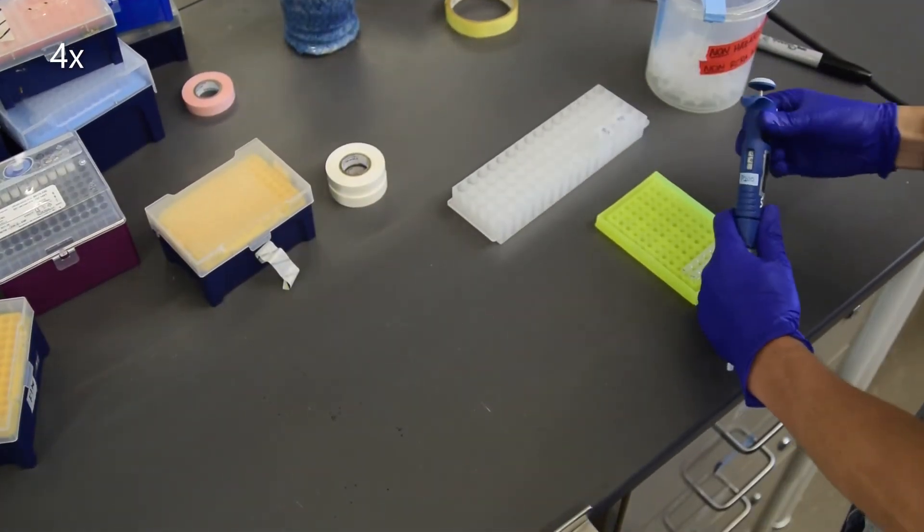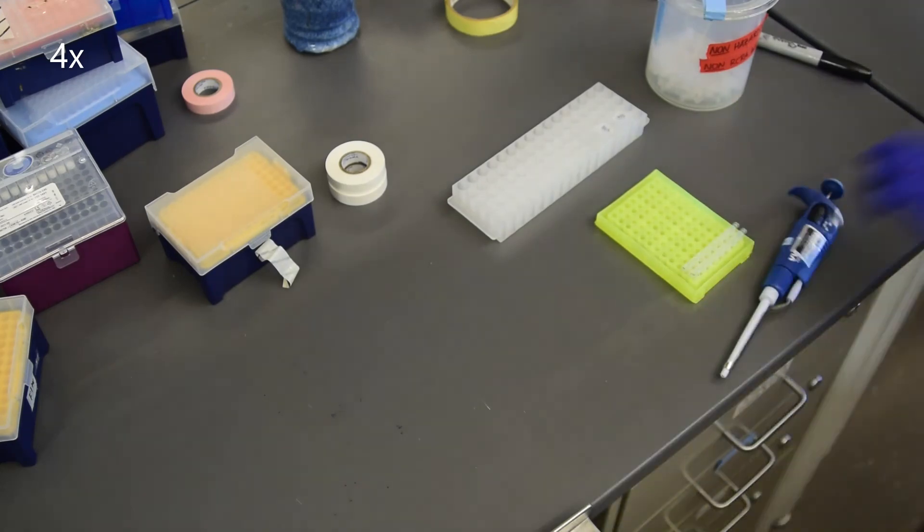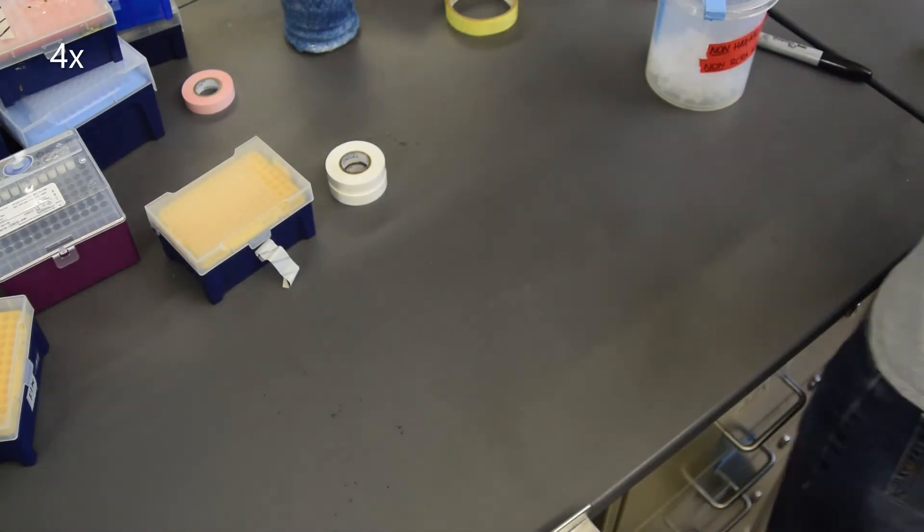Reset your pipette and clean up your workspace. ES and BSA go back in the freezer in your box. The strips go in the freezer if you are not using them for PCR right away.